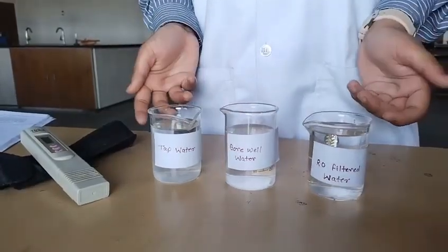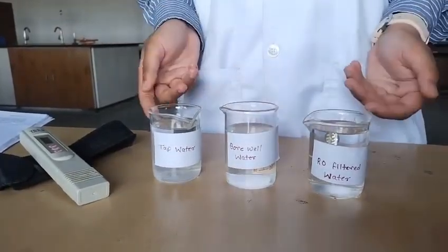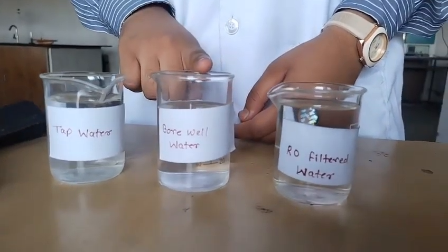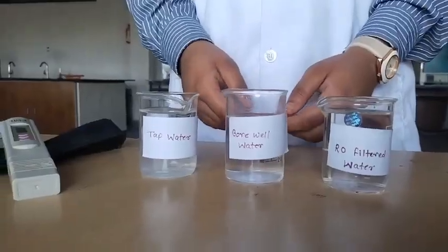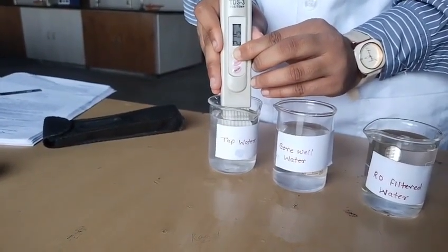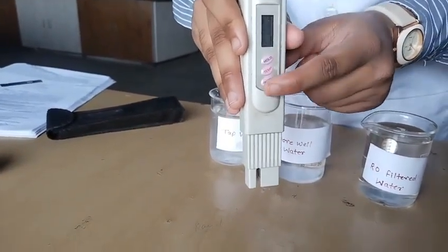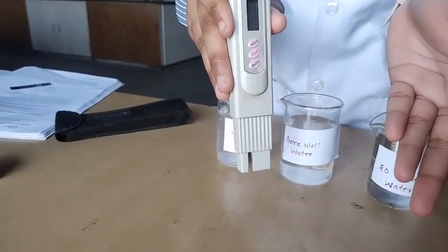In our experiment, we are going to use 3 types of water to determine different TDS values. The first one is tap water, second borewell water, and third RO filtered water. The TDS value of tap water is 215, which is healthiest water and good for cardiovascular health.